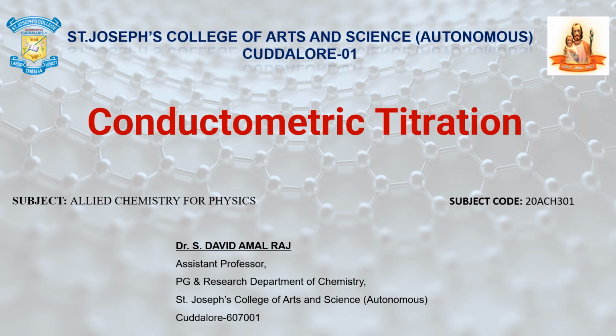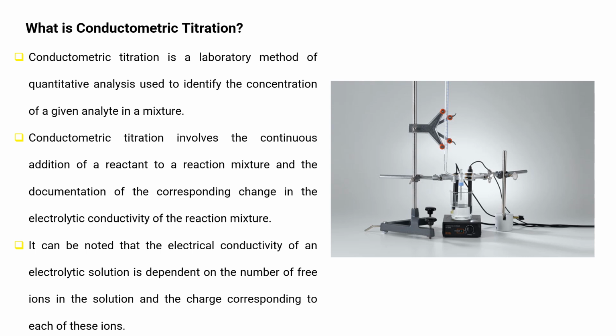Good afternoon, students. Today's topic is conductometric titrations. Identify the concentrations of a given analyte in a mixture.